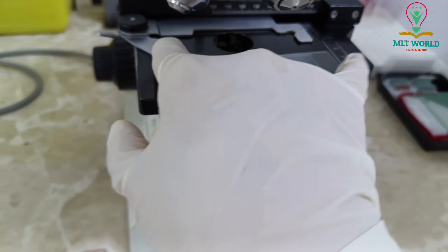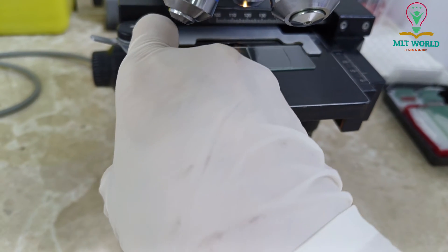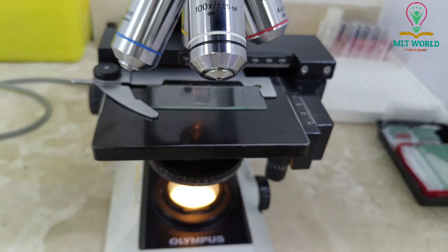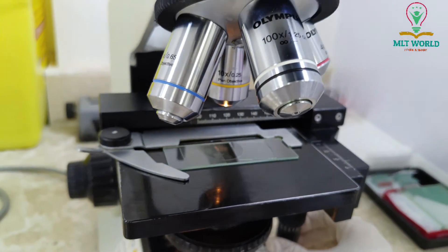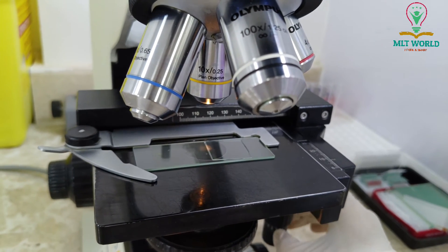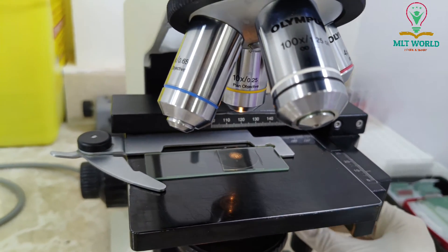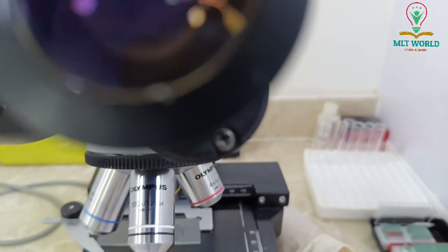I will place it on the stage, then first I will set the 10x lens to focus the field. Once you place the slide, move it to the center just under the lens area. Once centered, we adjust and then start reading.